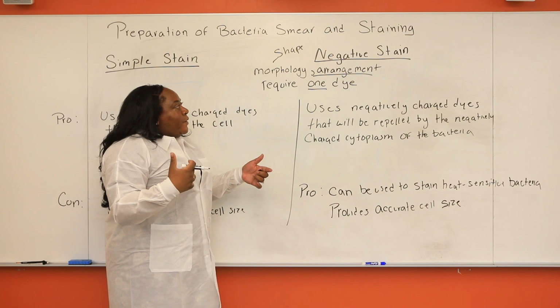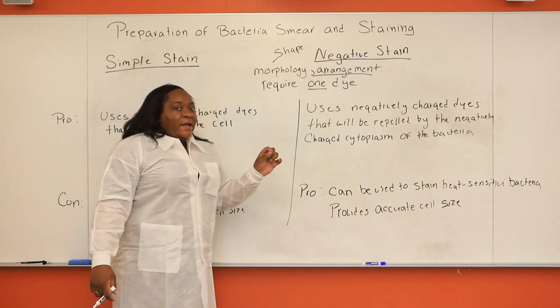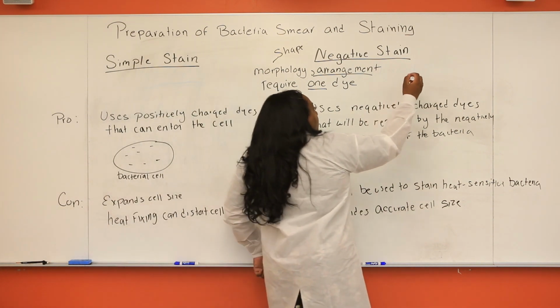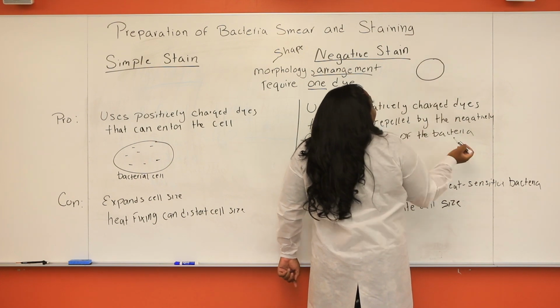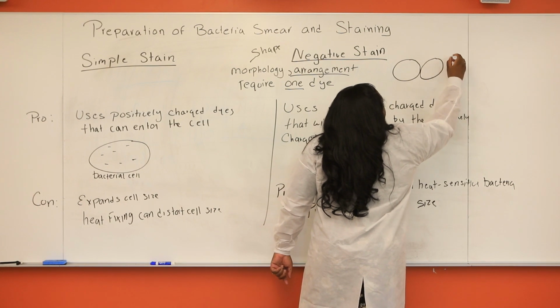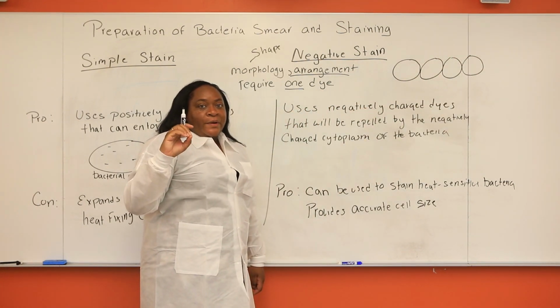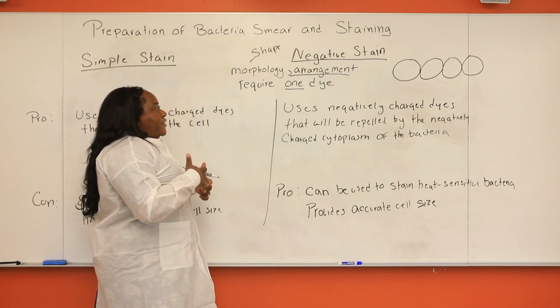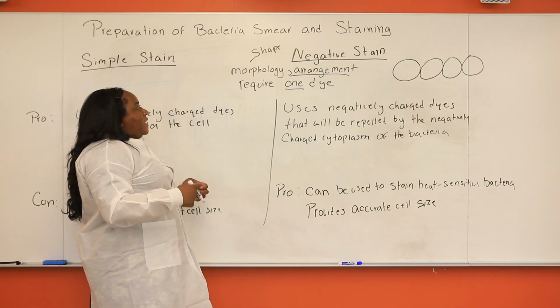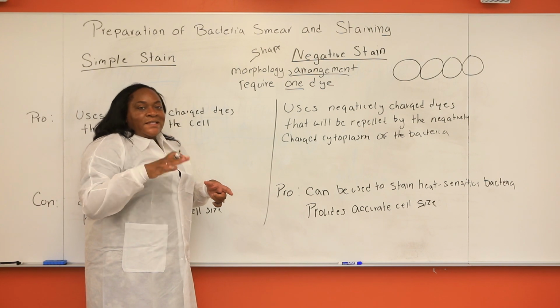If you remember, when we talked about bacterial shapes, there were three common bacterial shapes, right? Coccus, bacillus, and then spiral. Remember, coccus is the spherically shaped bacteria, right? But that spherical shape can appear as chains, and we call that strepto, remember? Or it could be a grape-like cluster, so there could be different arrangements of the morphology.